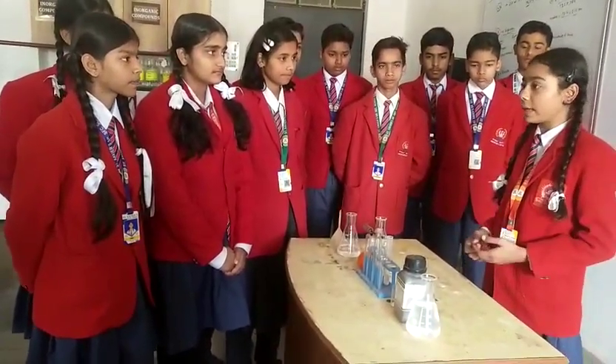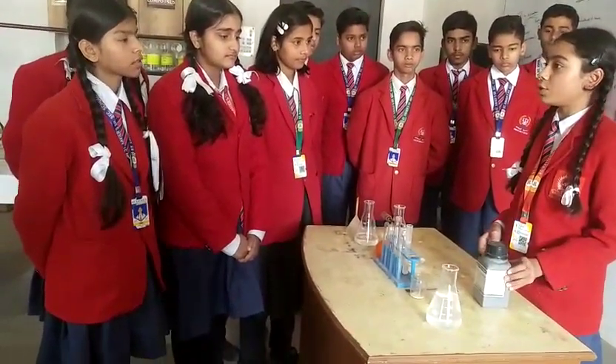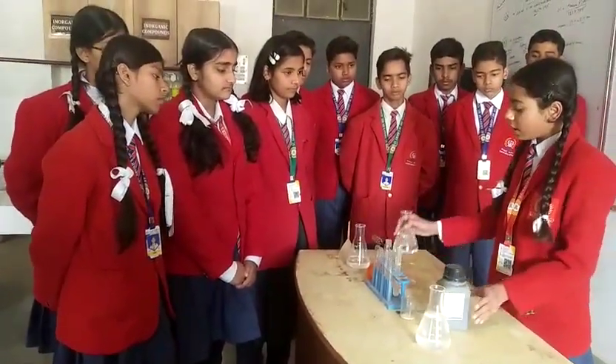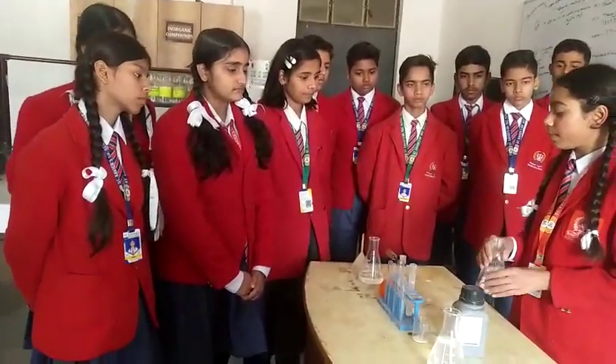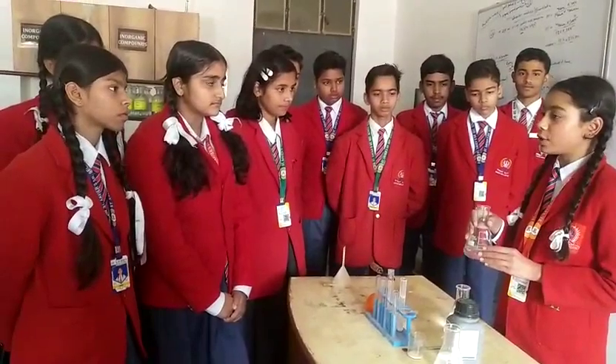So for this we have some material here. Here is a potassium permanganate which we are going to use in this experiment. In this beaker we have water and in this beaker we have some lemon juice, which we are going to pour inside the water.